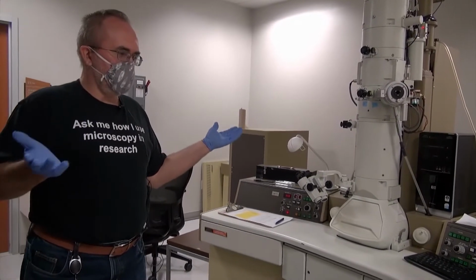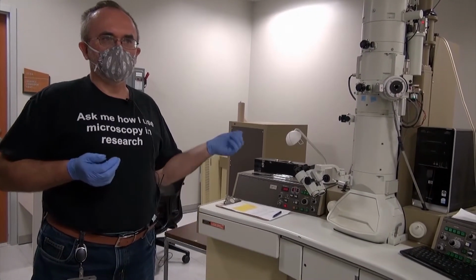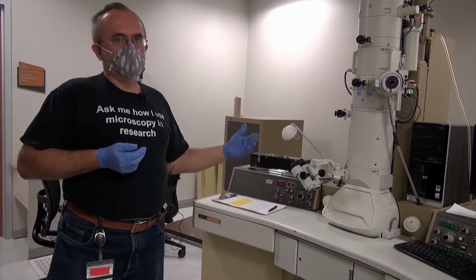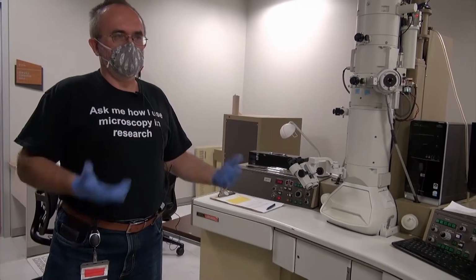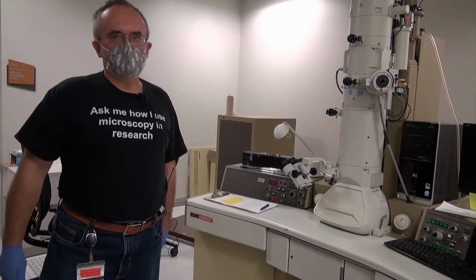In addition to biological samples, many of our users also use it for particle size analysis. They're larger nanoparticles or polymer samples and such.